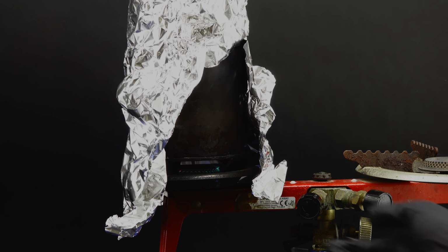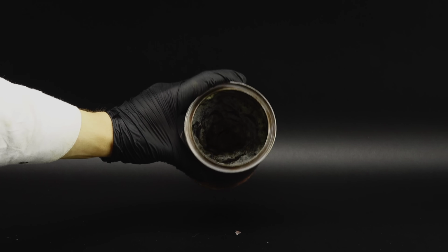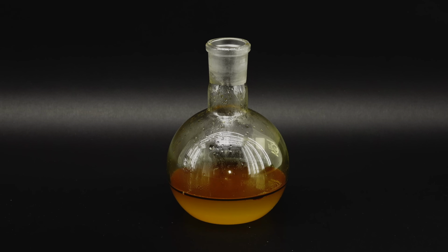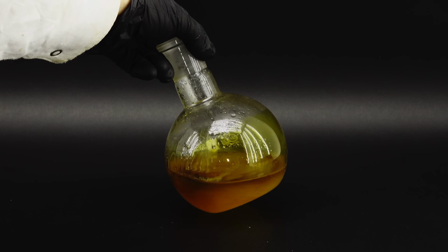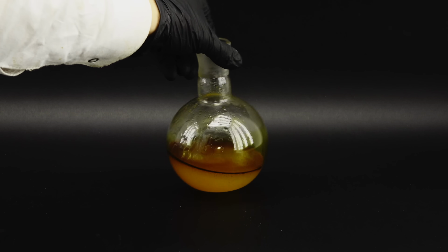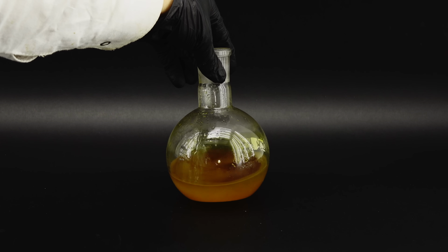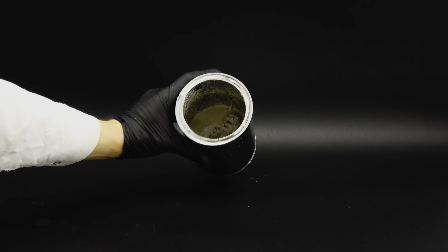can. After turning off the stove, I disassembled the apparatus, and apart from a white sodium and potassium carbonate brick in the can, I was left with this small layer of benzene floating on a bunch of ethylene glycol. It didn't seem like too much, however, I still have a ton of material to process, and I first wanted to take care of the second half of the hydrolysis mixture.